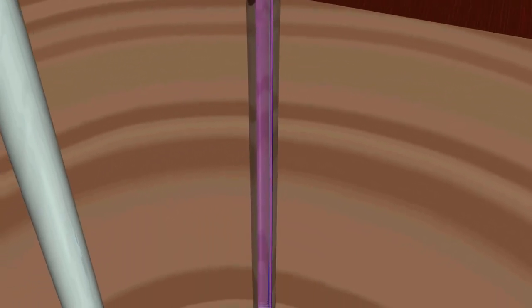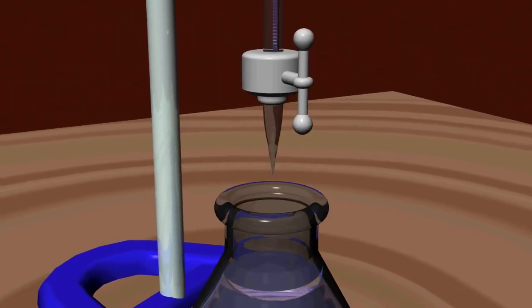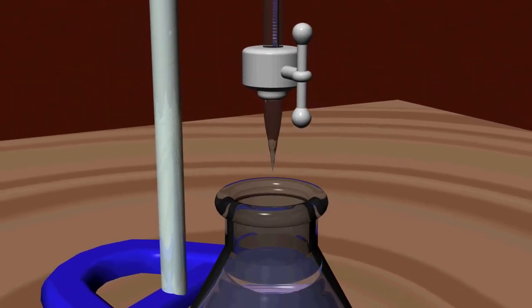Now, using the valve on the side of the burette, carefully allow the titrant to flow into the flask. While doing this, swirl the flask with your other hand.